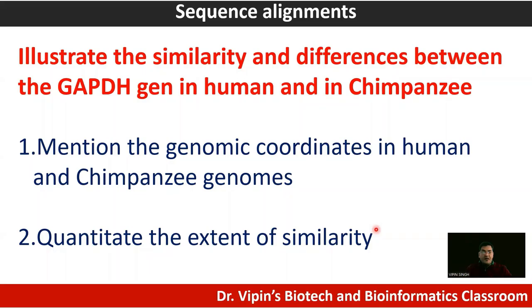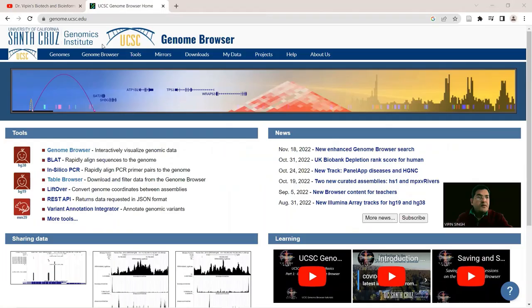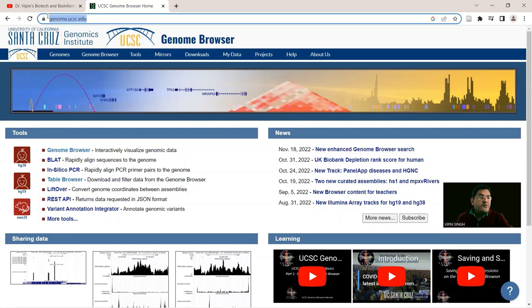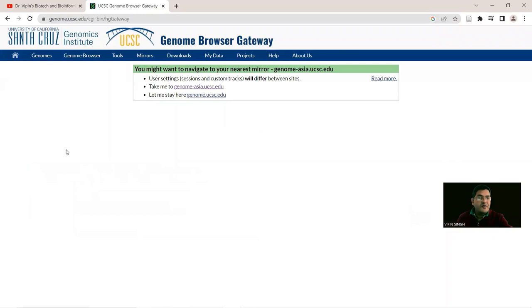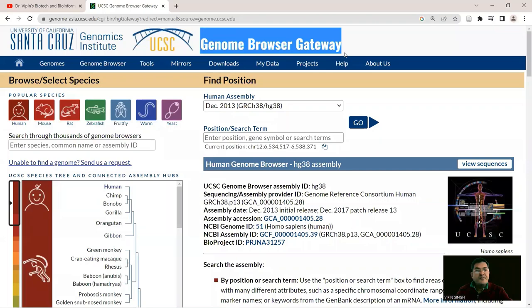Let's go to the UCSC Genome Browser at genome.ucsc.edu and click on Genome Browser. This takes us to the graphical genome browsing utility. We navigate to the genome.asia.ucsc site — the Genome Browser Gateway — where the human genome is present by default in the latest assembly, GRCh38.